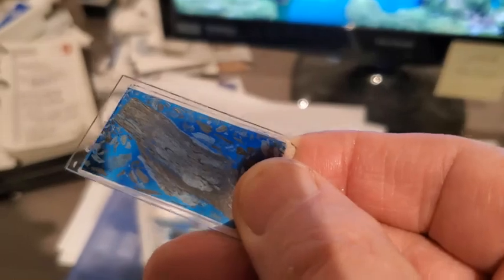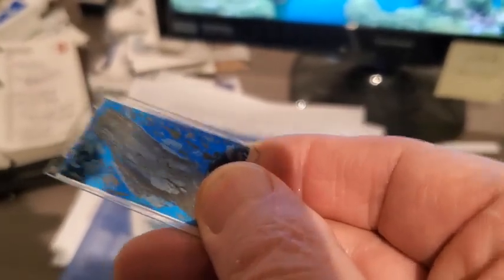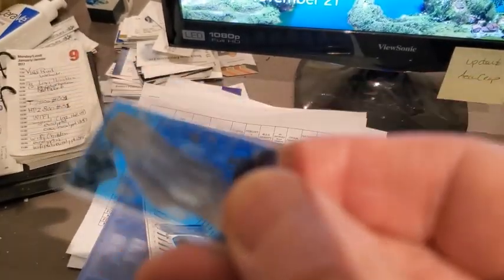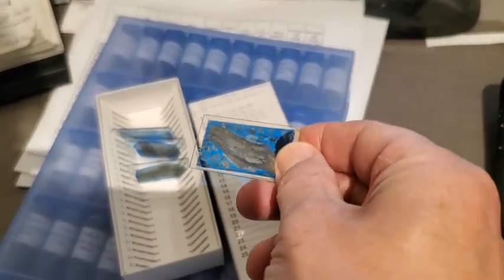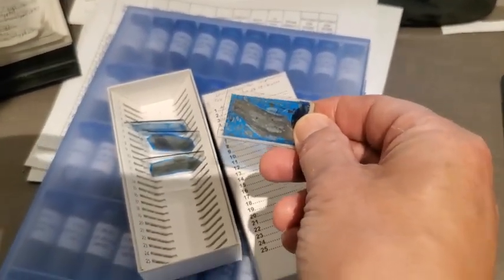and this is a thin section. It's two glass plates, and in between there is a very thin layer of rock, typically 30 microns. And to be honest, you cannot really read through it. I don't think so. Especially not when the rock is pretty complex.